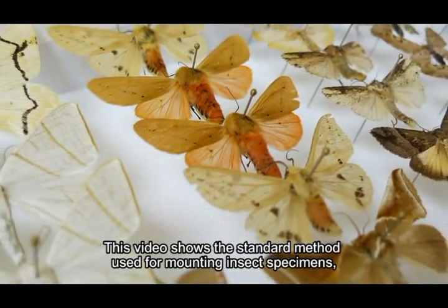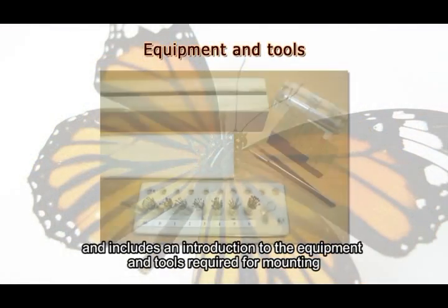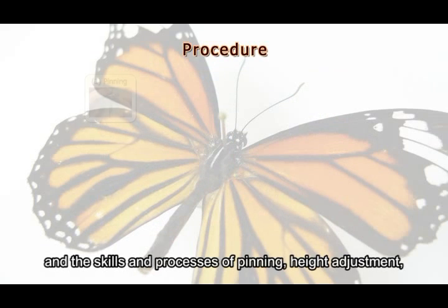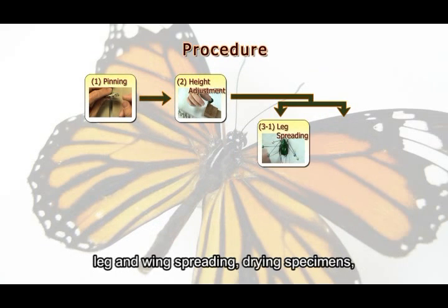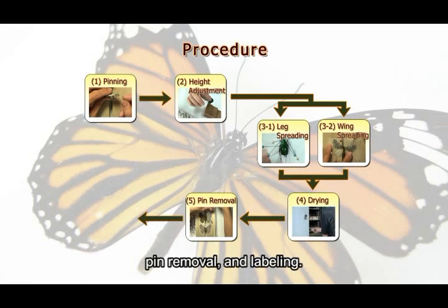This video shows the standard method used for mounting insect specimens and includes an introduction to the equipment and tools required for mounting and the skills and processes of pinning, height adjustment, leg and wing spreading, drying specimens, pin removal, and labeling.